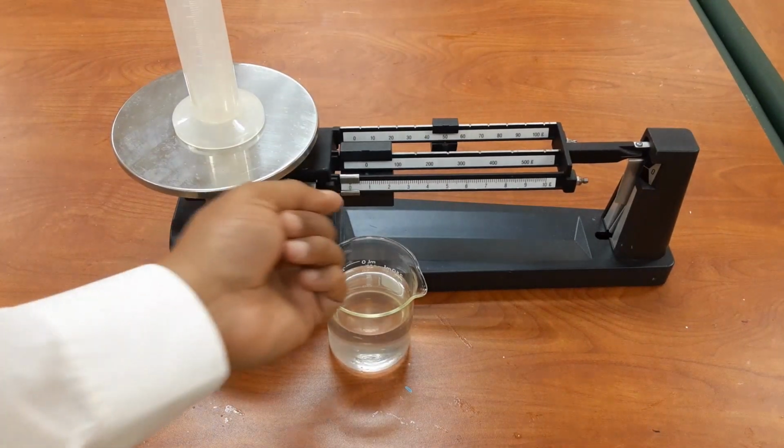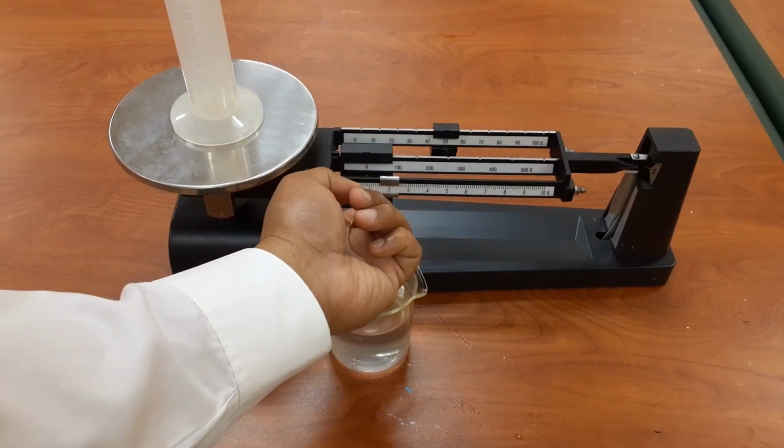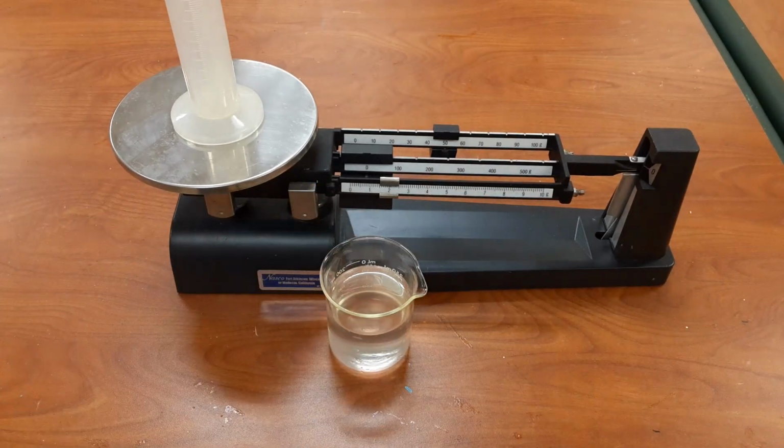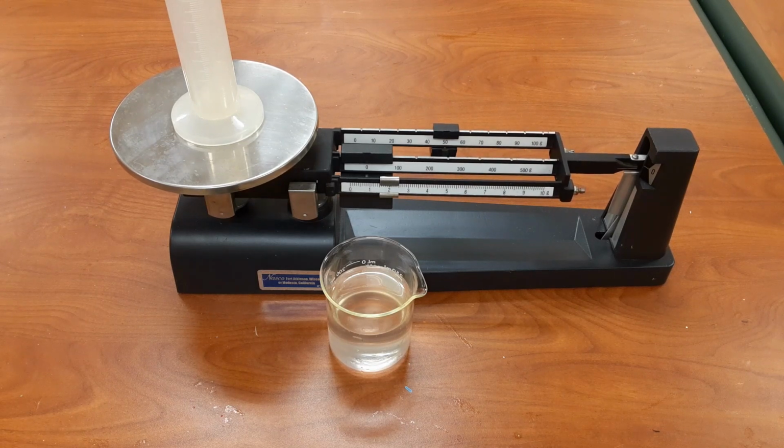I can see that when it is at 50 and 50.0, it's not balanced. So then I move this slider, and now I can see that the mass of the graduated cylinder is 52.0 grams. So please write this down somewhere in your lab report, that the mass of the empty graduated cylinder is 52.0 grams.